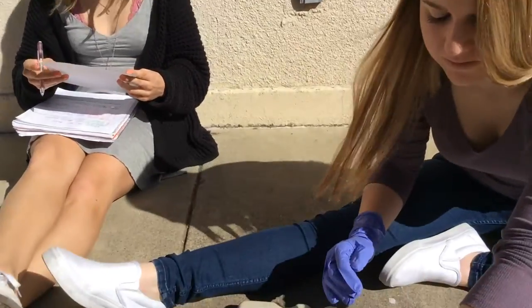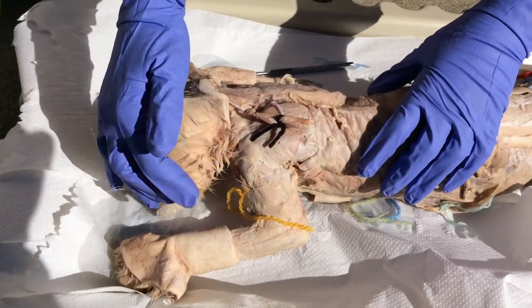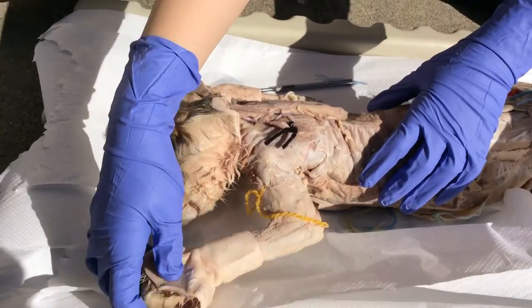First, we have the shoulder muscle in yellow called the deltoid, which abducts the shoulder. It's on the outside of the shoulder, so it pulls the shoulder away.